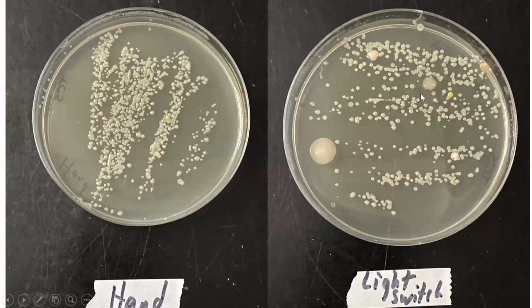I did do some swabbing after class last day. I almost forgot, but a couple students reminded me. I'll show you the results here. I took some photos this morning. So palm of the hand. Palm of the hand usually shows up pretty typical.